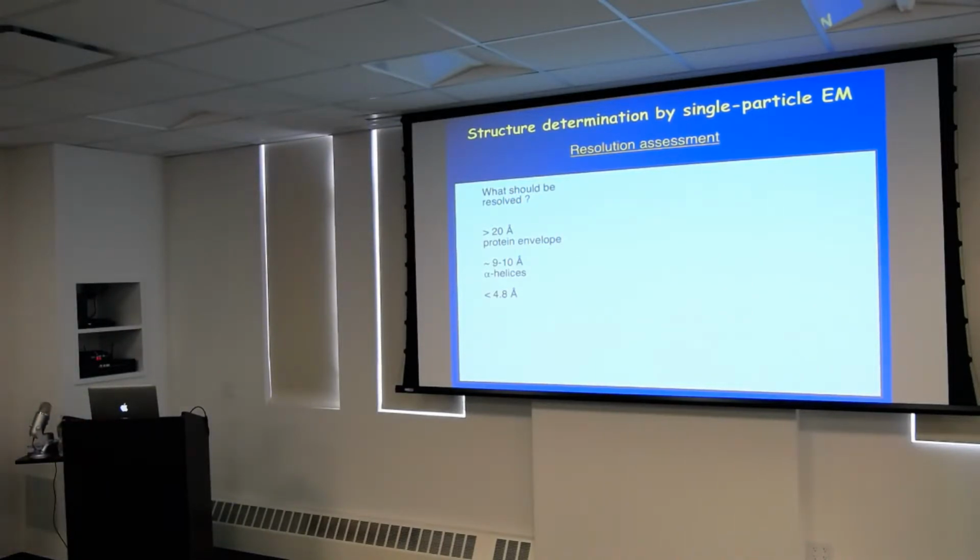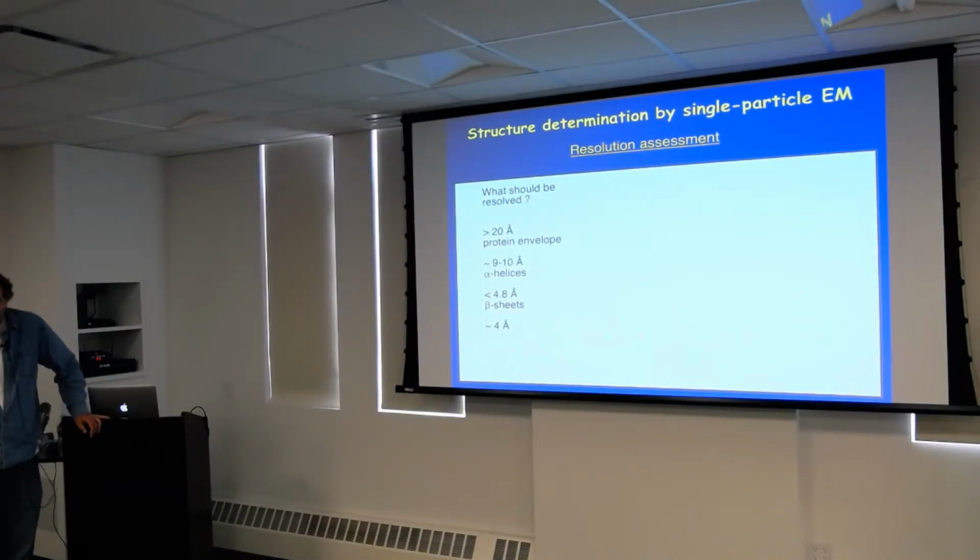Okay, Ed, tell me, what is it? Okay, beta sheets. Even with all that hints, they still haven't done it. So now at 4 angstrom, don't say hydrogen bonds. That's so embarrassing. 4 angstrom, what are you going to see? Connections between the secondary structures. The connections between secondary structures.